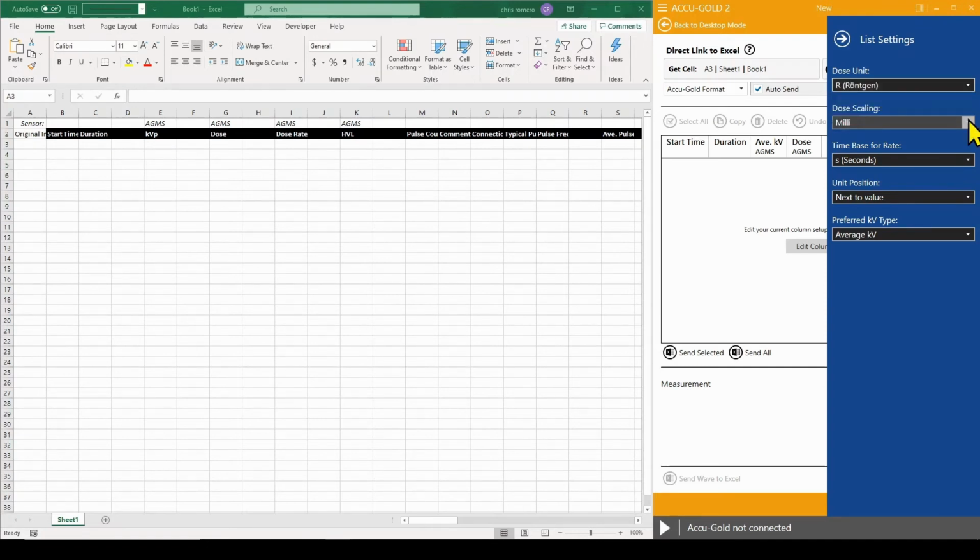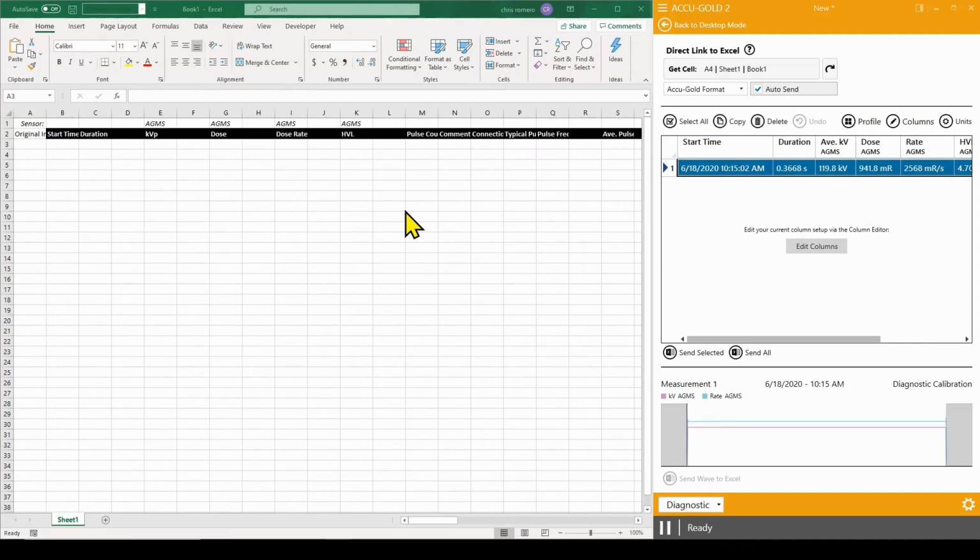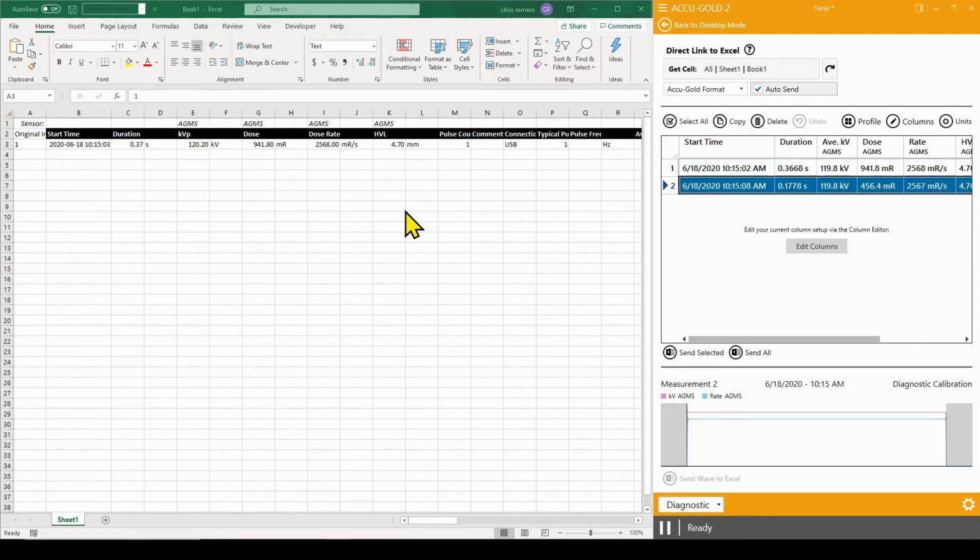Now that Companion Mode is ready for use, you can begin measuring to collect data. Data outputs can be linked to any cell in a template by selecting the destination cell and creating a cell reference to the datasheet if you are creating a report. To demonstrate, we'll use a blank sheet.